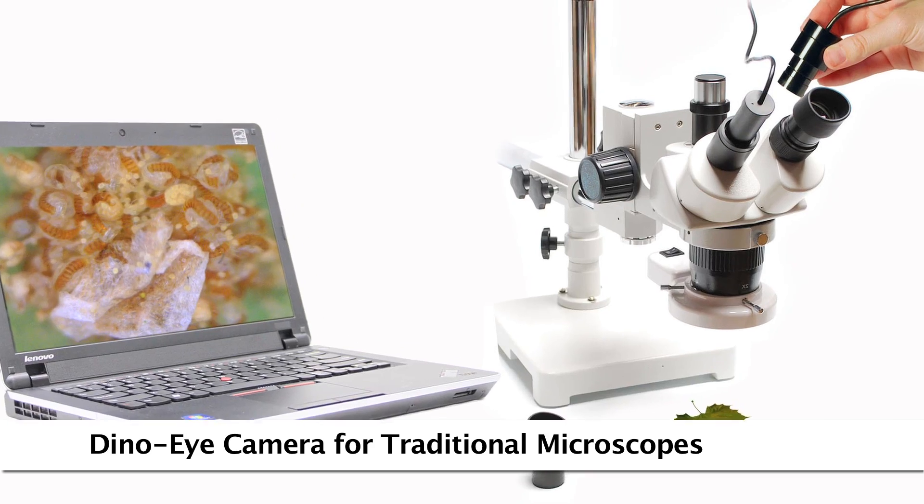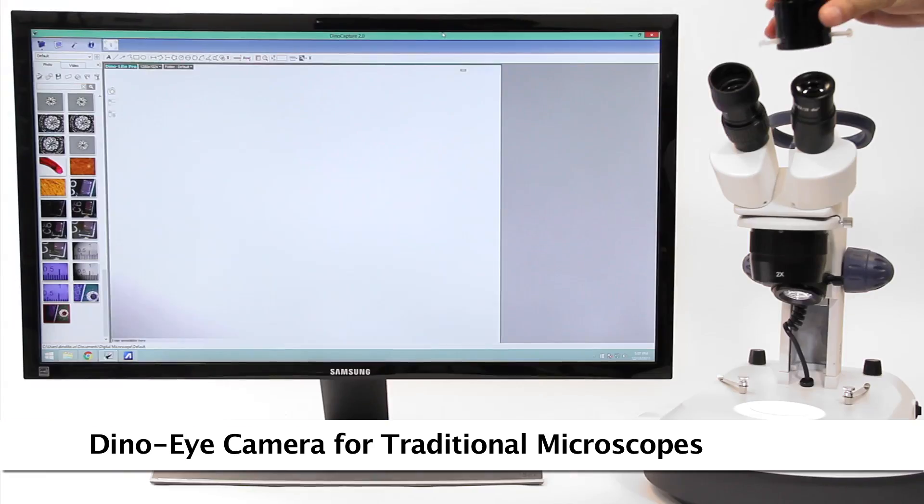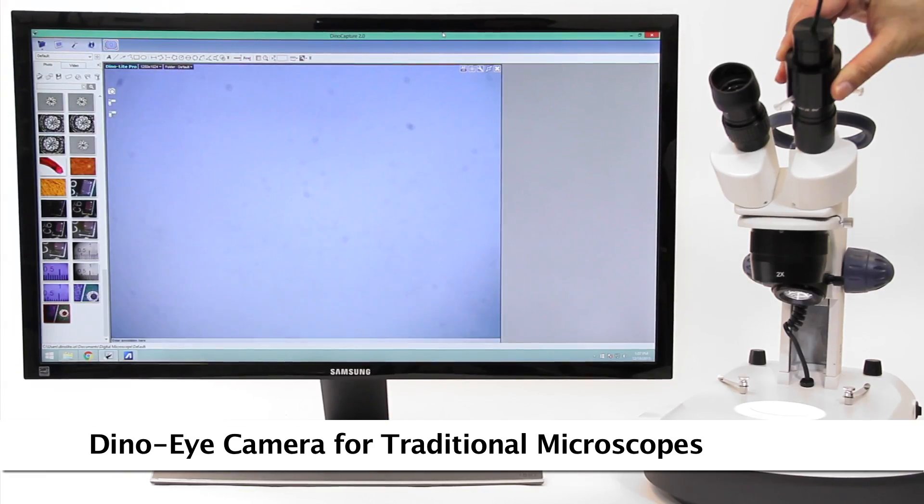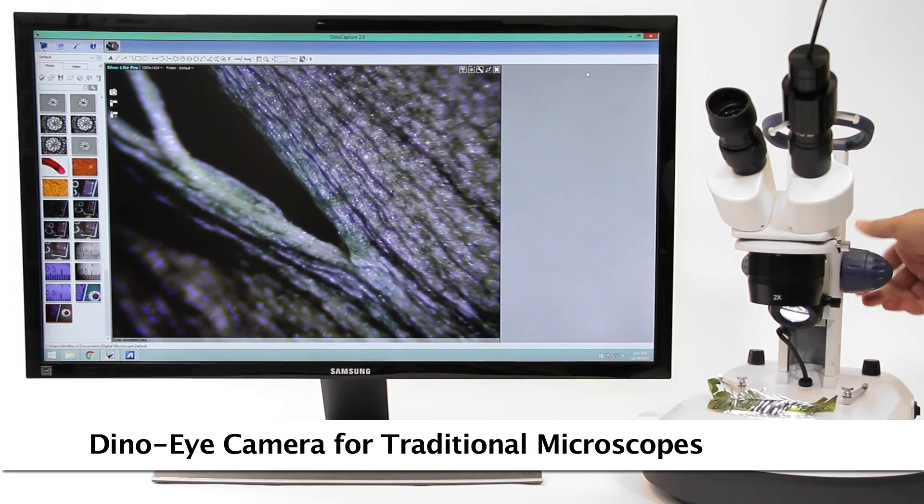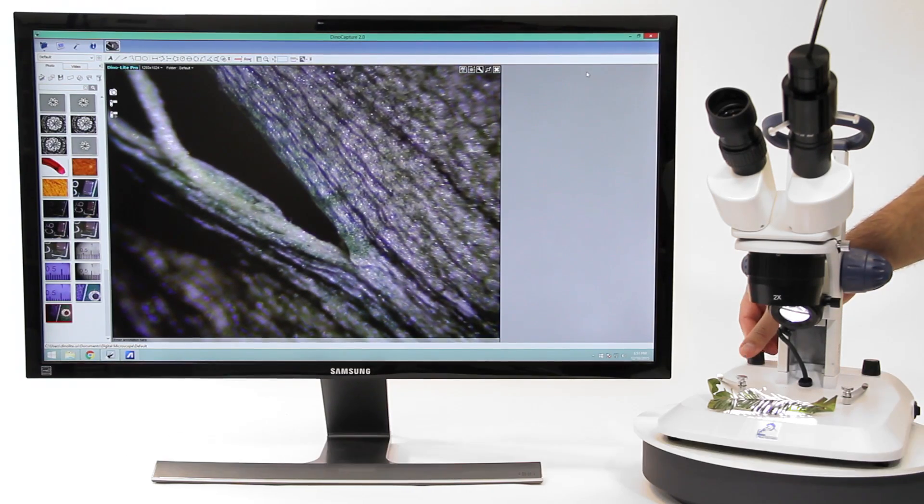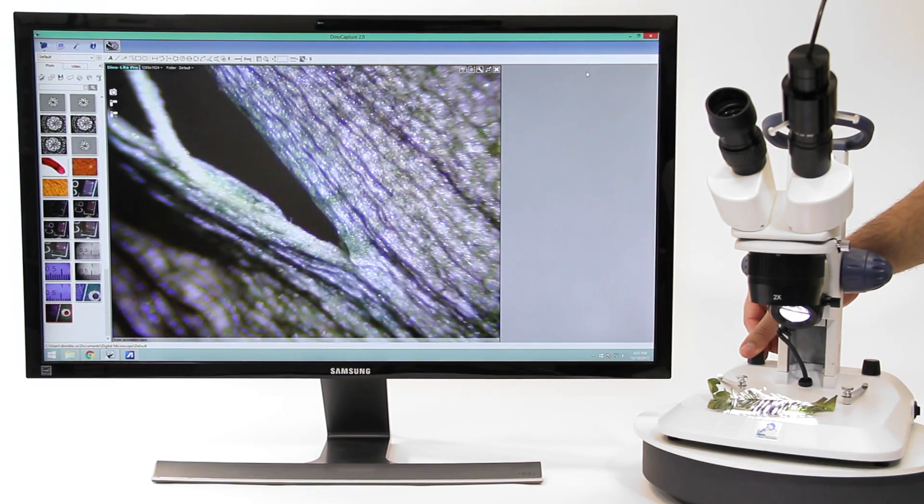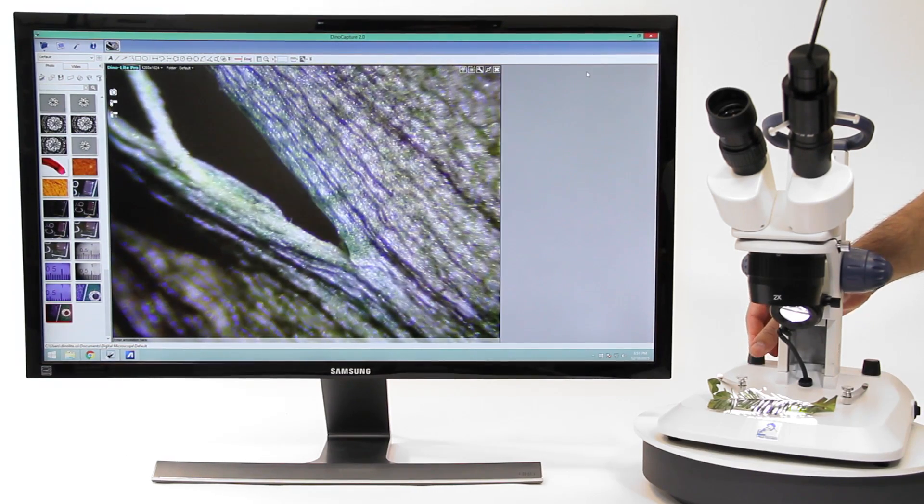Convert your existing traditional microscope to digital by replacing the eyepiece with a DynoEye eyepiece camera and using the same included DynoLite software.